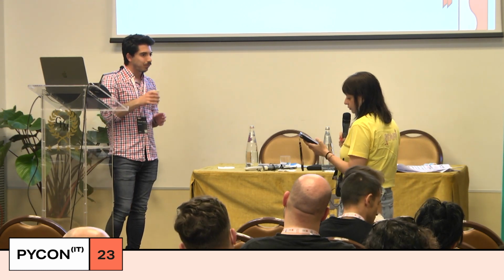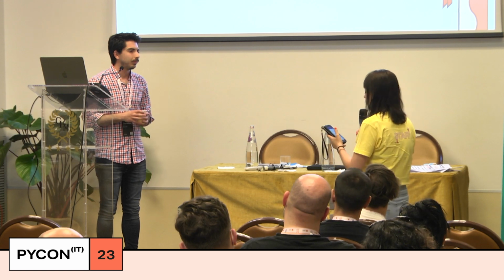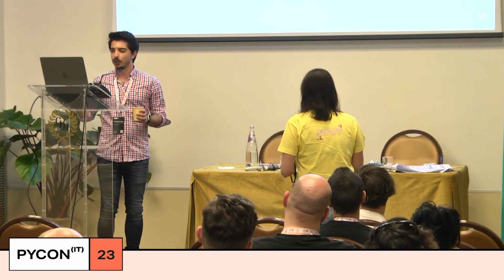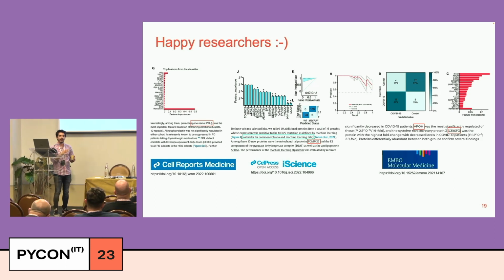Well, you kind of answered, because the question is whether OmicLearn has already been used to discover any important or well-acknowledged biomarker, but you show some research based on... Yeah, exactly. So I can show you again. Some biomarkers were found, and they were also overlapping with what the researchers had already found by applying their own strategy. And in the second case, they put asterisks. So the proteins marked with the asterisks are also overlapping with their research. So the tool performs and results in good biomarkers, I would say.